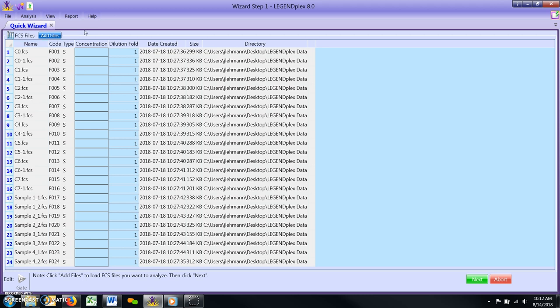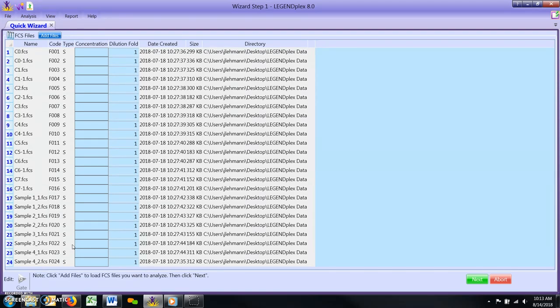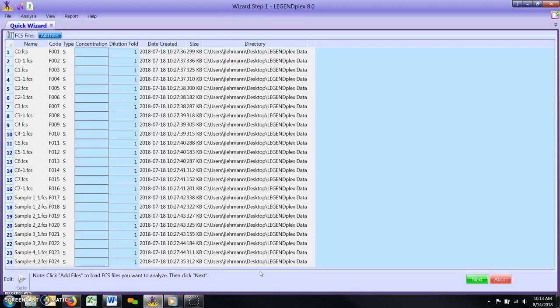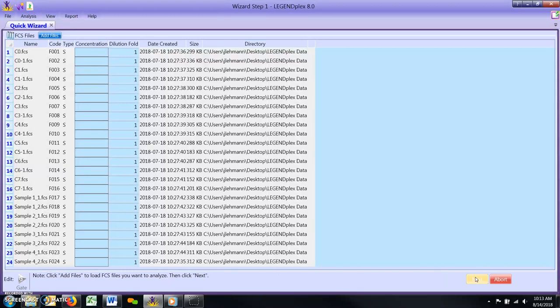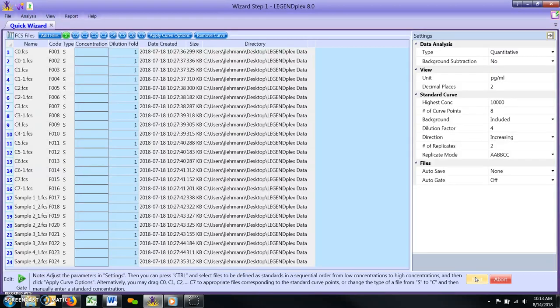Alternatively, files can also be click and dragged to their appropriate location on the list. The properly ordered file list should now contain the standard curve files at the top of the list, followed by all unknown samples sequentially arranged by replicate. Once this is accomplished, click the green Next button on the bottom right of the Quick Wizard.